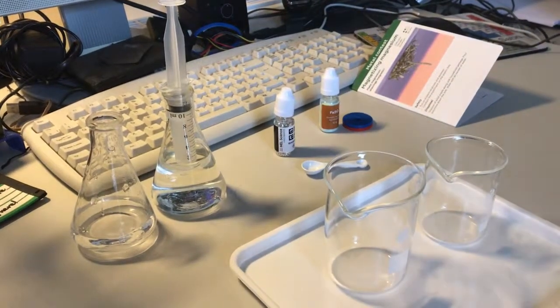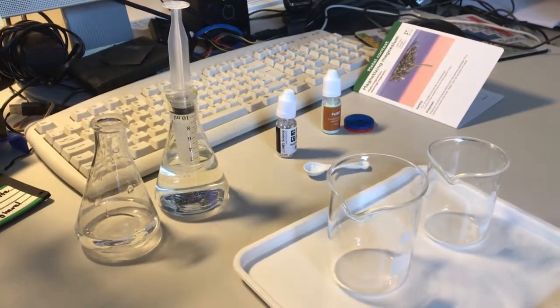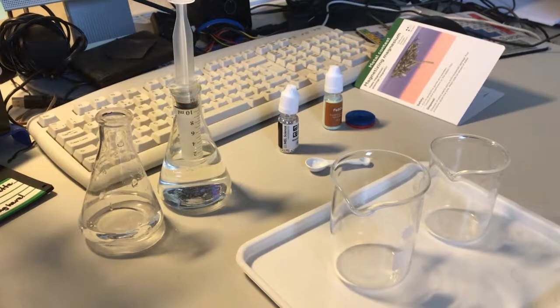Hello. In this experiment, we will see how we can take two non-magnetic substances, magnesium and iron sulphate, and create a magnetic substance by mixing the two.